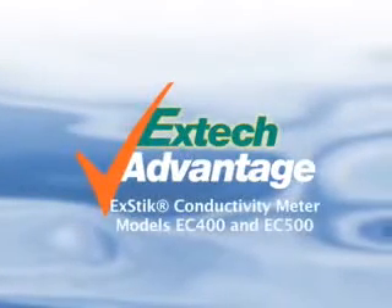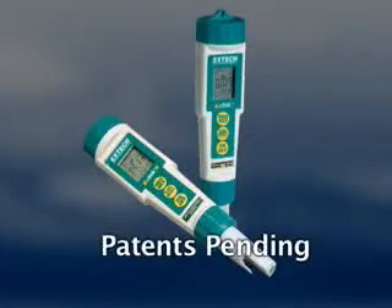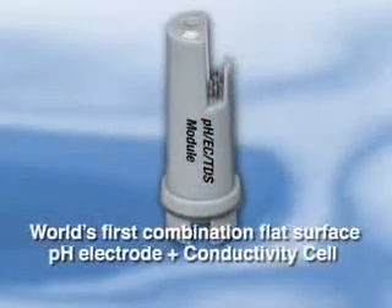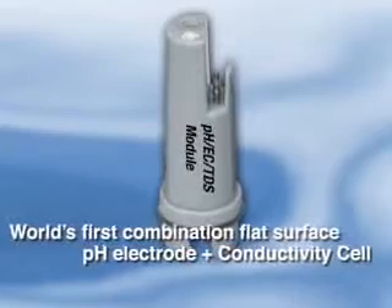Discover the simplicity of multi-parameter XTEC2 conductivity meters designed with an auto-ranging combination electrode. XTEC is the first to develop the combination flat surface pH electrode with built-in high-accuracy conductivity cell.